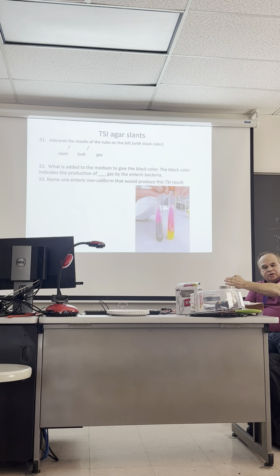No, hydrogen sulfide. So it's K A hydrogen sulfide, because it's black. H2S, hydrogen sulfide. Okay? Good? So here I have fuchsia here, I have yellow there, and I have cracks and fissures. A A gas. K A gas, that's exactly right. Good job. Who said that? Rebecca. Okay, yes, that's correct.